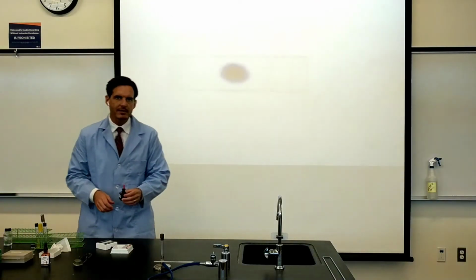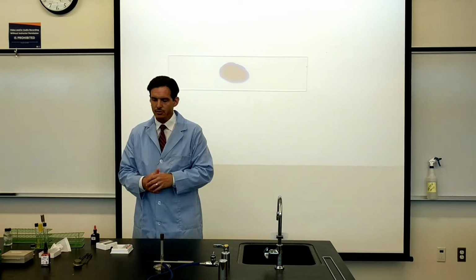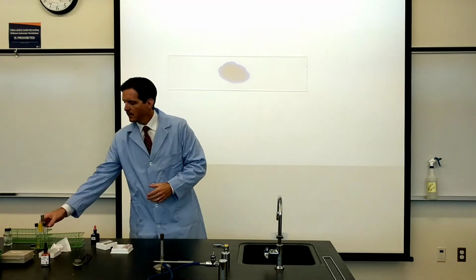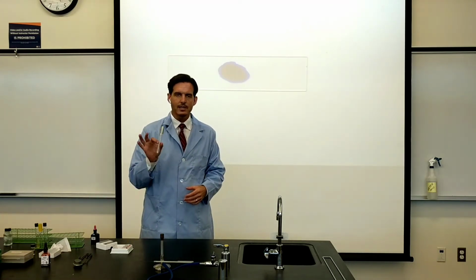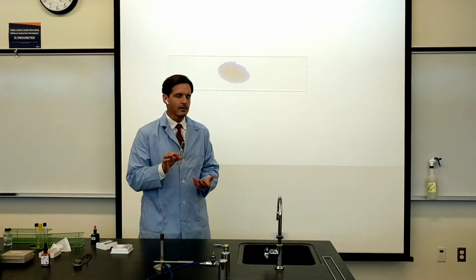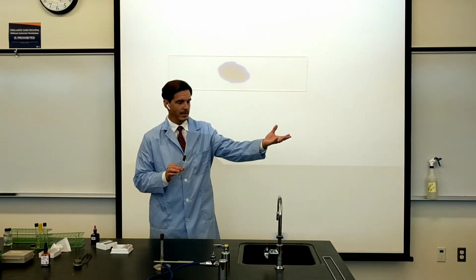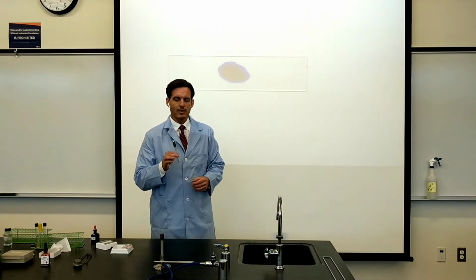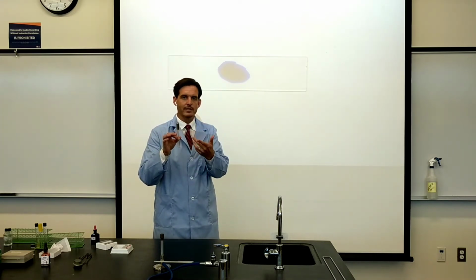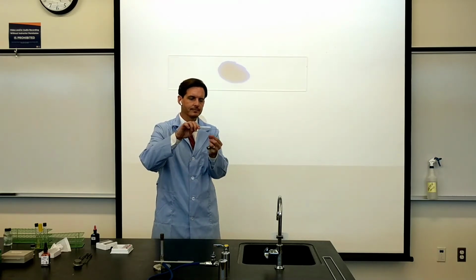So I have my drop of methylene blue dye, and the second step on that set of instructions was to stir in some cheek cells. And I have a cotton swab. This is one way to get cheek cells. Another way is to use a toothpick. I think that the toothpick actually works a little bit better, but I didn't find any at the current moment. I think what I may do is use the back end of the cotton swab, which is a wooden stick, as a toothpick.